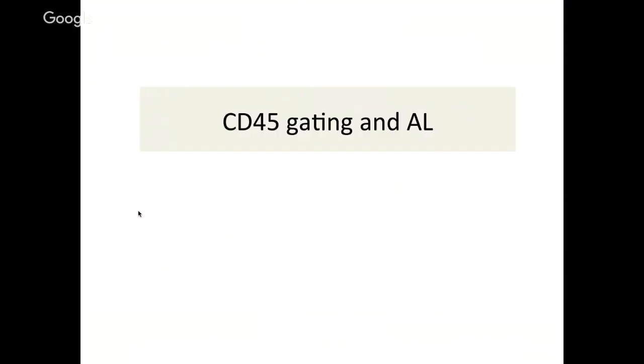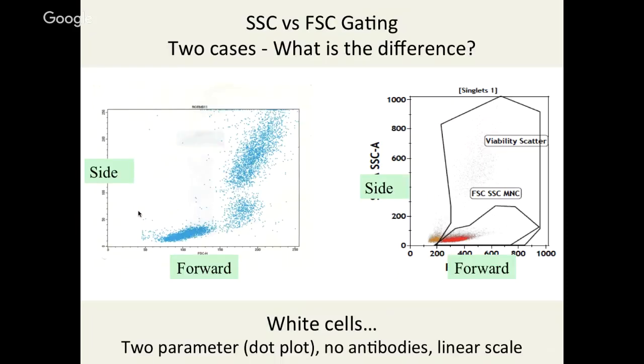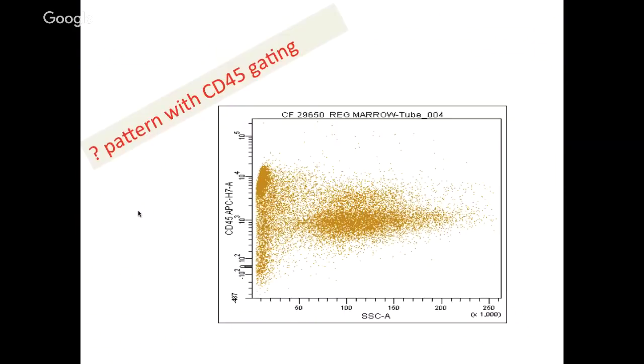Now, second, how do you differentiate whether there are lymphocytes here, or blasts here, or they are mixed? So we can take the help of an antibody called CD45, leukocyte common antigen. It's a very important marker in flow. CD45 gating, we call it, is a cornerstone in any case of acute leukemia. Our analysis starts from CD45 and ends with CD45. Now, if you look at CD45 on the y-axis and side scatter on the x-axis, you see many populations, five to six dense areas. So this is CD45 strong, where I put a small circle cartoon here. CD45 strong cells with low side scatter are lymphocytes.